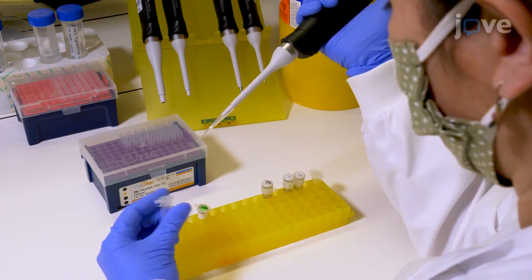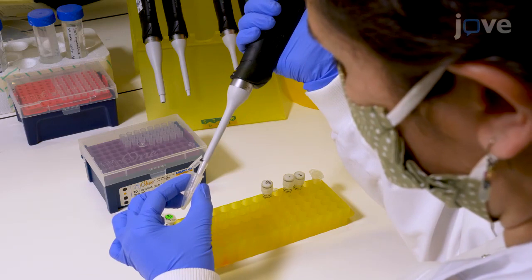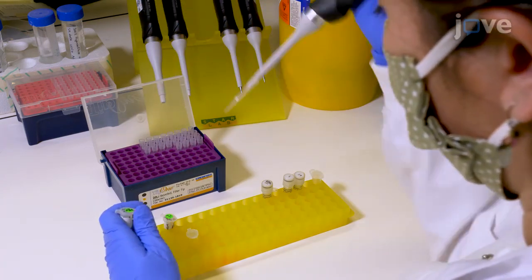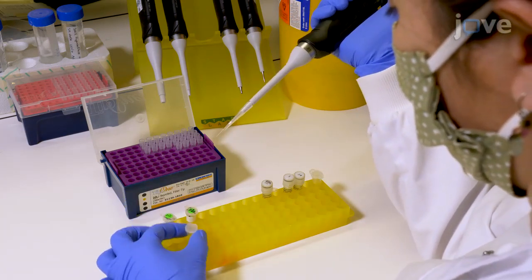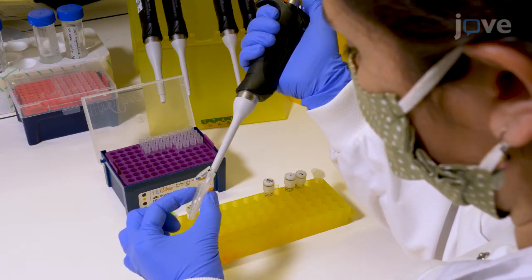Combine the attB-tagged donor plasmid carrying the transgene of interest and the helper plasmid carrying the integrase to obtain a mix with a final concentration of 350 nanograms per microliter of the donor plasmid and 150 nanograms per microliter of the helper plasmid.